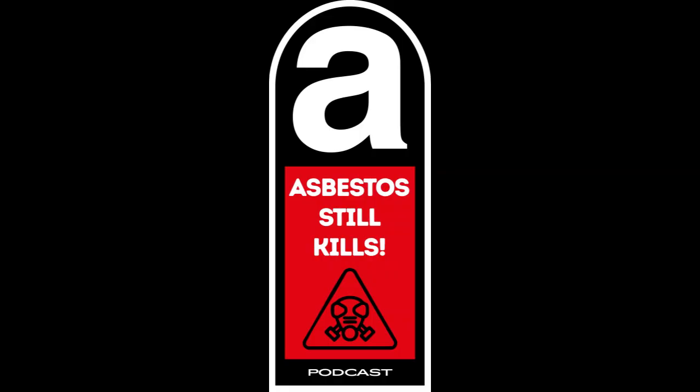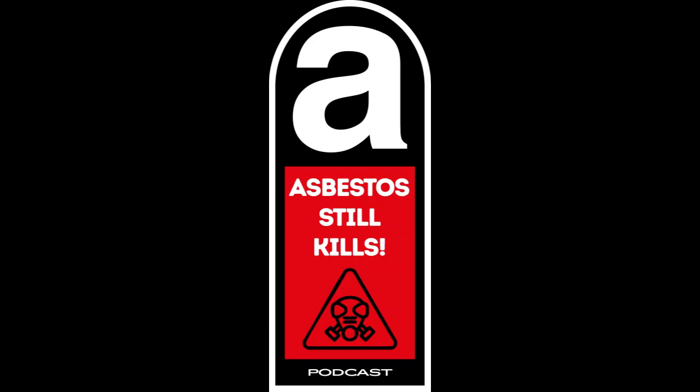Only last week I had some samples come in, and they're coloured sands. These coloured sand samples came from China, and they're used in kindergartens and preschools. They're fluorescent: the reds, the yellows, the blues, the pinks, etc. And we actually identified them as tremolite asbestos.